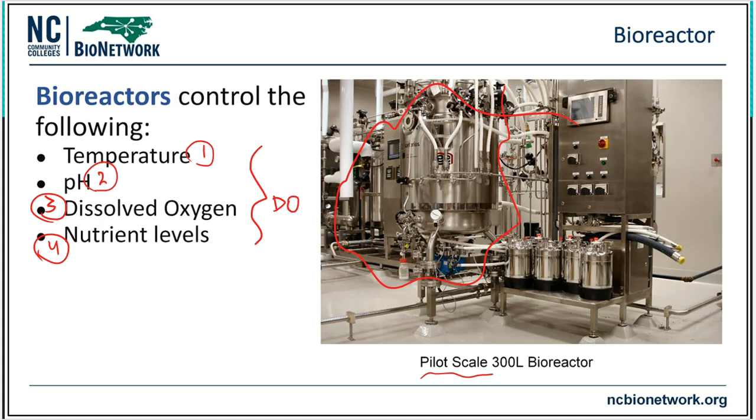And that means I have to add over a course of time to make sure that that supply does not run out. Okay? So for instance, I'm going to give you an example here. Let's say that we are trying to make our own moonshine. Moonshine, woohoo! We're going to make Popcorn Sutton happy today. All right, so in that particular flask or container or barrel in the middle of the mountains, I'm going to probably put in some yeast.